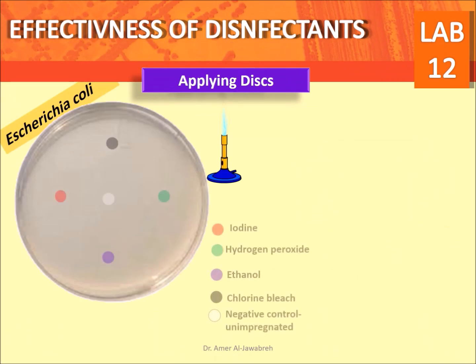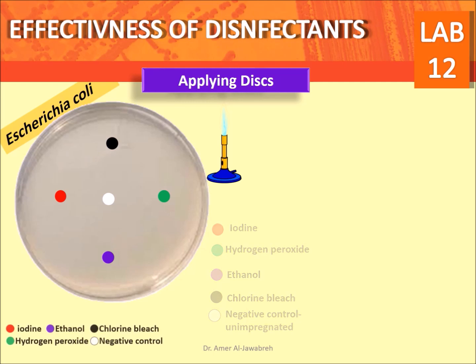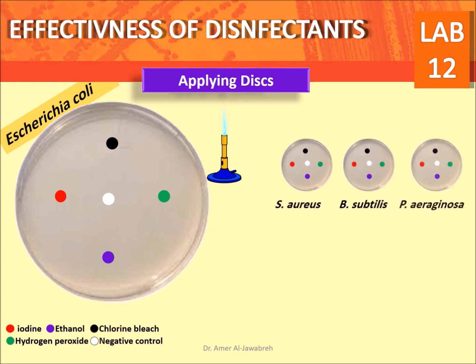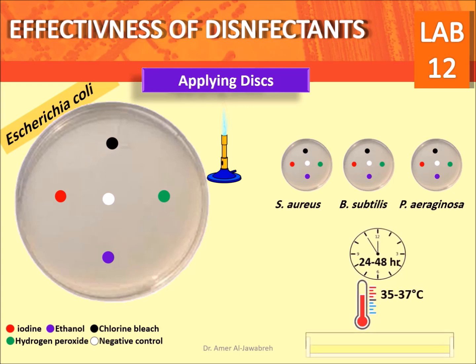Applying disks: aseptically place the immersed disks 20 mm from the rim and from each other on the corresponding plate. Incubate in an inverted position at 37 degrees Celsius for 24 hours.